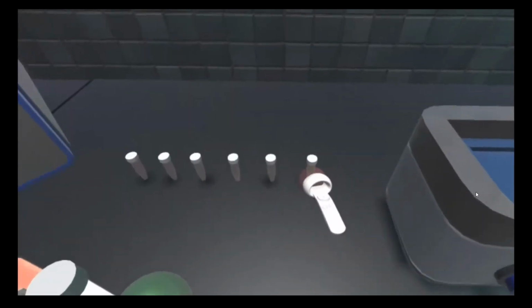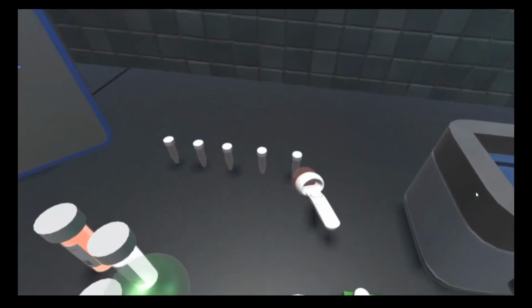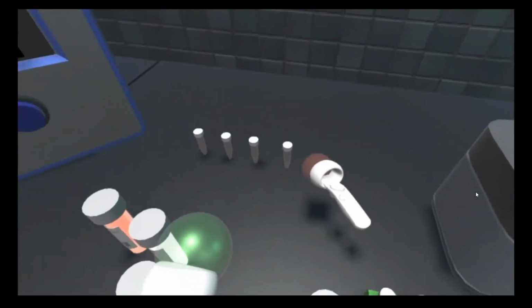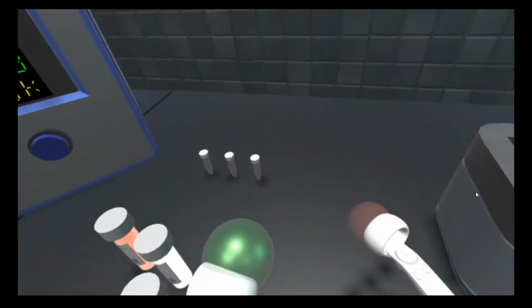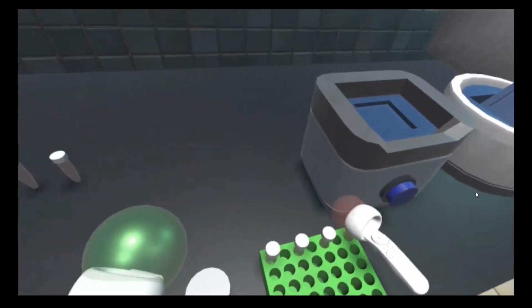While some of the laboratory is simplified or expanded for ease of use in virtual reality, the principles underlying the process remain accurate and precise. Using pipetters, students will prepare 4 saliva samples, one of which will test COVID positive. The goal is to properly determine which one this is by following the exacting requirements of a PCR test.